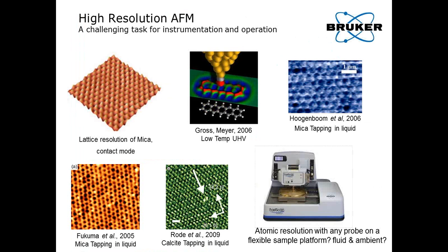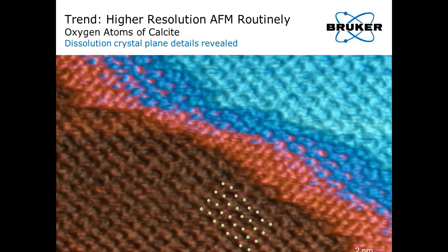Another part is to get a higher resolution. With scanning with STM, the resolution is intrinsically high, but with AFM, of course, if you do it in UHV, it's not too bad. You can get atomic resolution, molecular resolution, and how to do it more routinely in ambient condition or in fluid, that's still a challenge.